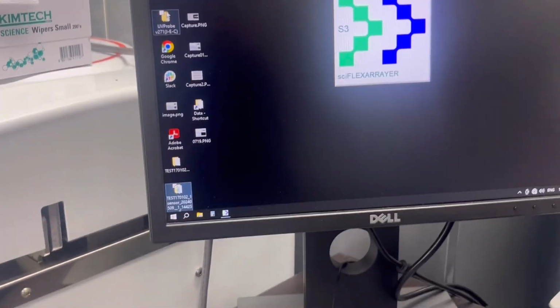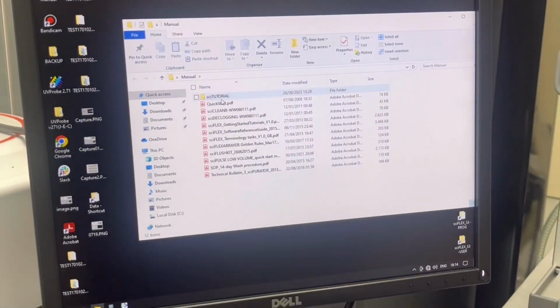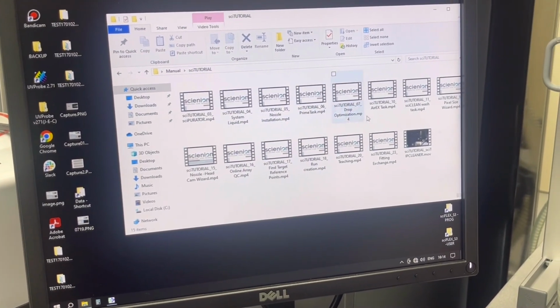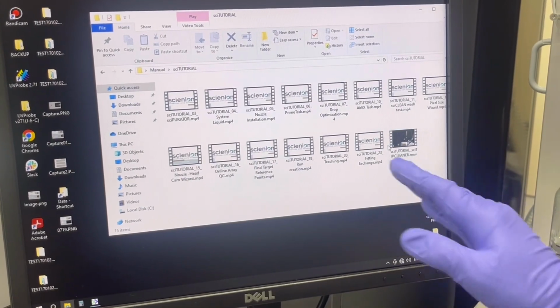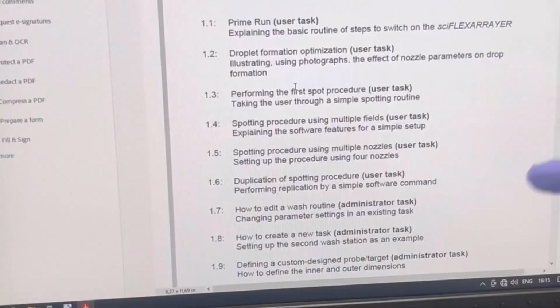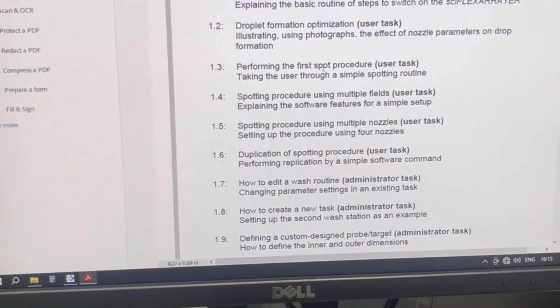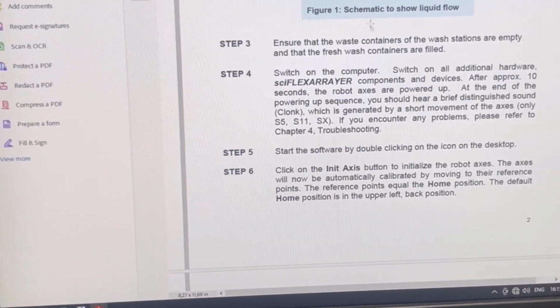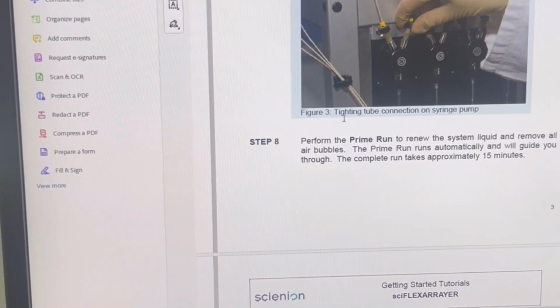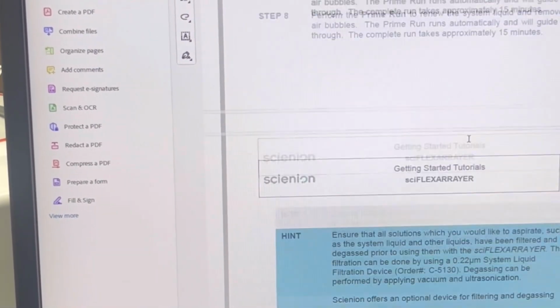Where is the manual in here, and it will show the answers. I already took the video, like how to do it. I will send this one to you, and you can read that. Okay. Yeah. For that, for this one, like tightening the screw. Yeah.